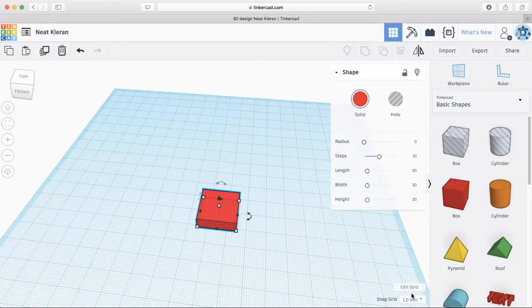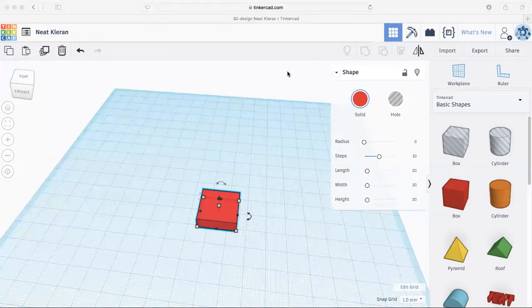And now I'll switch over to Slicer. The first thing I want to do is go to File and load the config file. This is just a file that contains all the pre-saved settings for the material that we're printing with. So in this case, I'm going to choose the Pluronic 14 gauge config file. And just to double check, the print settings over here in this pane on the right should confirm that you have your settings. And now I can go ahead and click add, and I'll choose the object that I just made from Tinkercad.